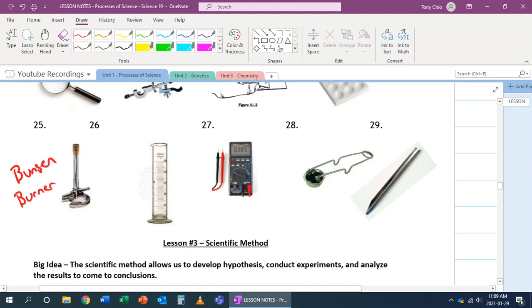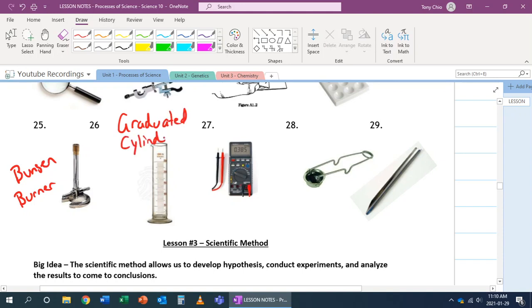Number 26. This is called a graduated cylinder. This is so that we can measure volume very, very accurately. 27. That's called a multimeter. It allows us to measure any voltage current, in this case, also resistance of electrical circuits.